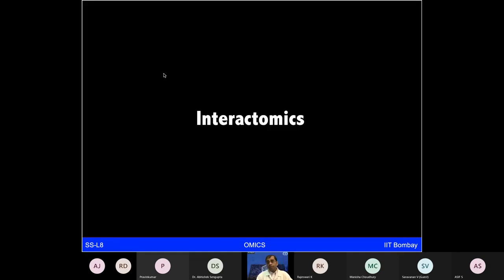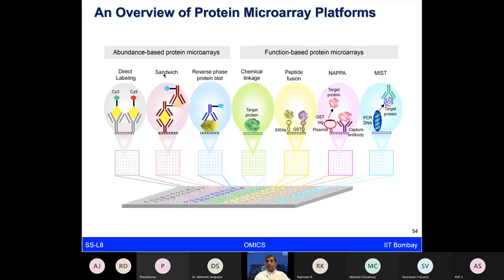Other technologies and approaches commonly used in the field of proteomics, you have got some flavor of it, especially mass spectrometry based, from mass spec to protein microarray based approaches. And microarray, you have seen Professor Graham Ball giving you some data from ArrayExpress and some analysis of that. So we also use the array-based platform, and the applications are different.